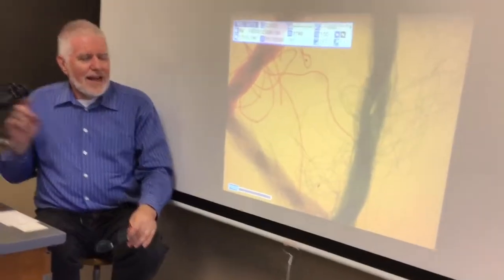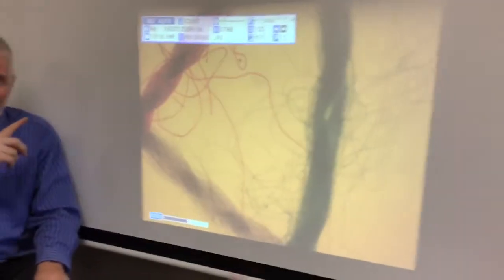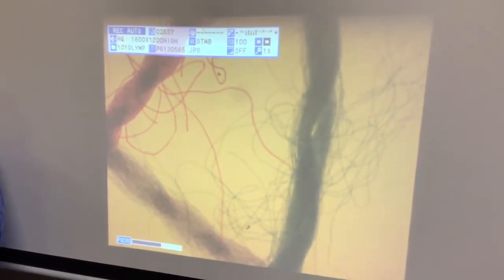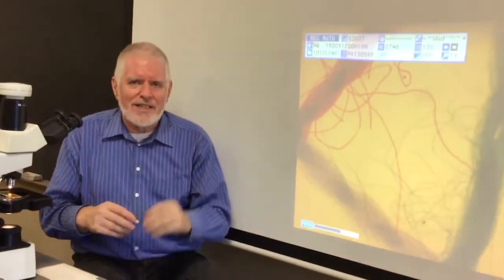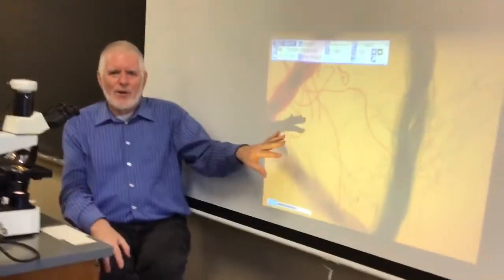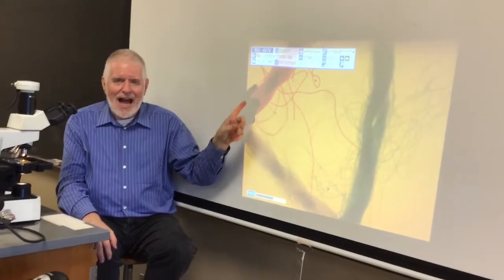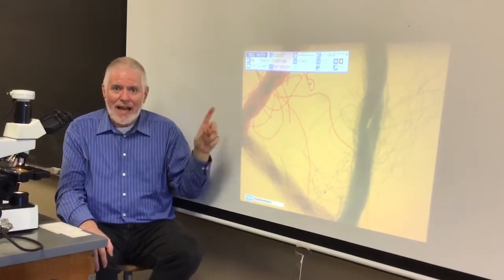Okay. Question 2. Draw the threads the way they look under the microscope at low power. And again, label the colors or draw them with a colored pencil. And this leads into one of the tricky questions on the lab, which is, okay, the microscope has made this bigger. You can see stuff that you wouldn't see otherwise because it's bigger. Something else has changed between seeing it with your eyes and seeing it under the microscope. And I want you to tell me what that is. It is literally right here and right in your drawings.